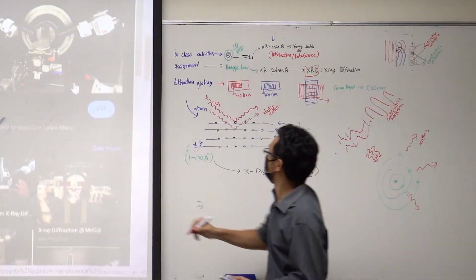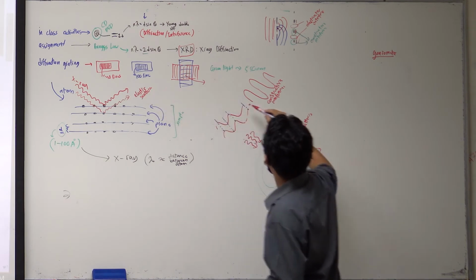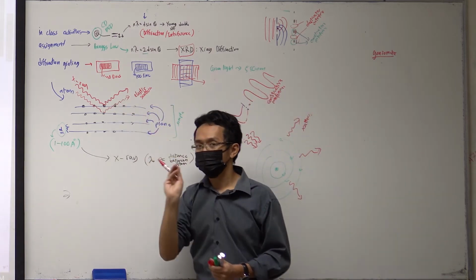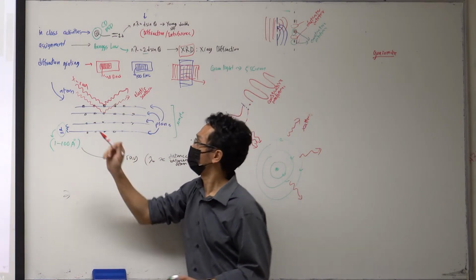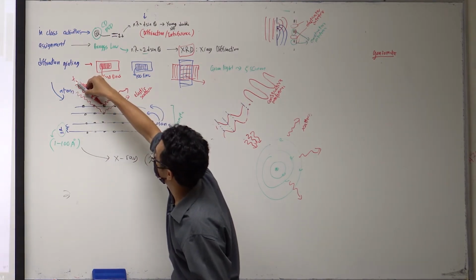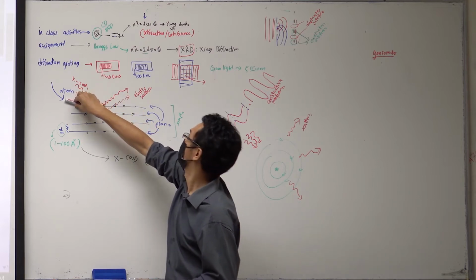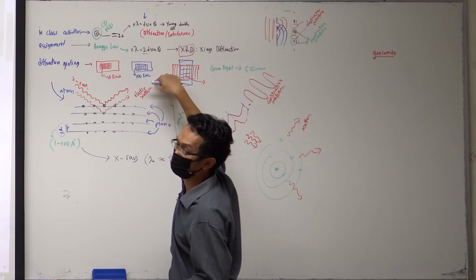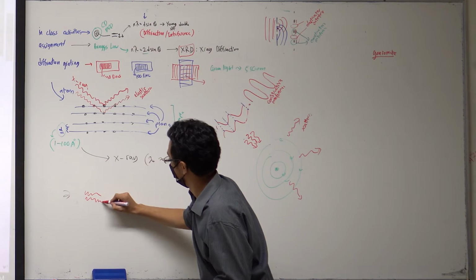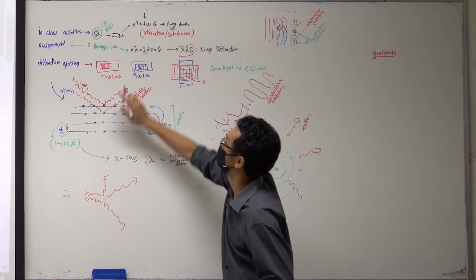It moves because, in order to get this elastic scattering where the interference is constructive, there are only specific angles. If you shine at another angle, then it might not be elastically scattered like this. Maybe you just go here, go there, and so on.